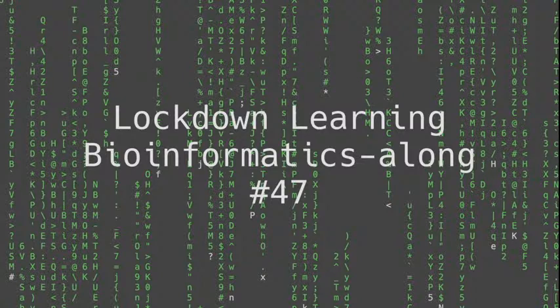We're going to look at a widely used tool for visualizing the alignment of short reads to a reference genome, a genome browser. I suspect that will take up quite a lot of this hour. If we have time, I'll move on to something else, but I think I'll probably be able to prattle on about IGV for an hour or so.